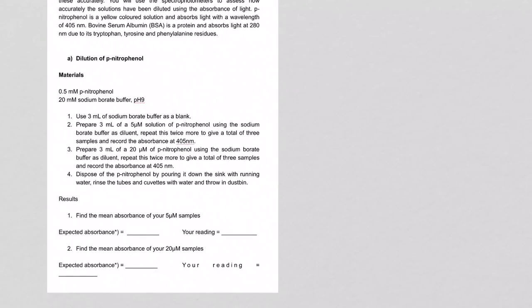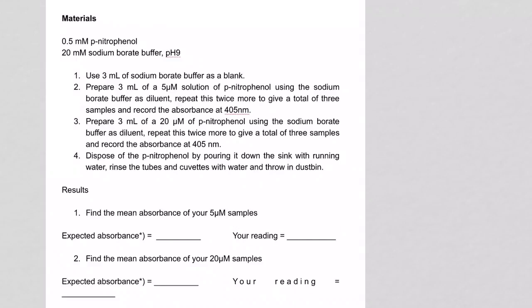In the second experiment, you have to do a little bit of dilution. And again, you have to use your pipettes. And in this case, we don't use a balance as a tool. What we use is a different tool to actually measure the concentration of something. And we will go into more detail how you measure concentrations in one of the next lectures next week. We use a fairly sophisticated machine, which is called a spectrophotometer.